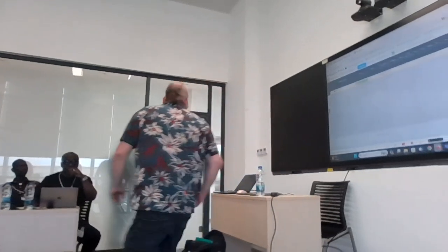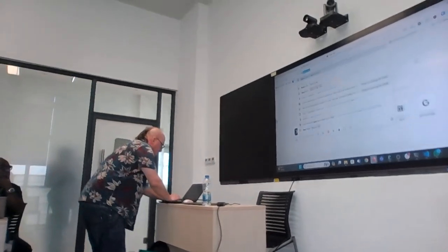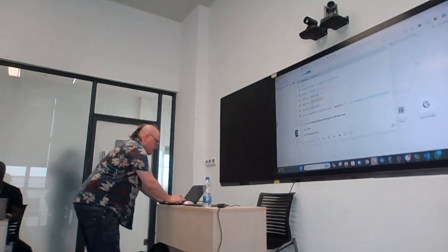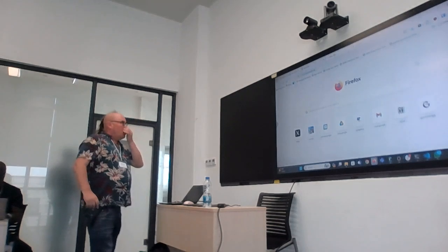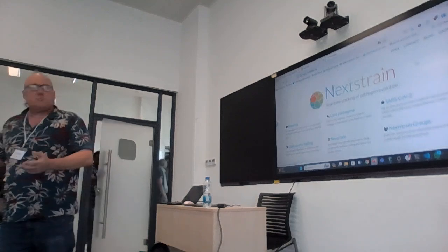I've chosen, let me just show what I've done. I've gone backwards on the tree. Okay? Nextclade. You always need to know where you are in the world of data. Okay?